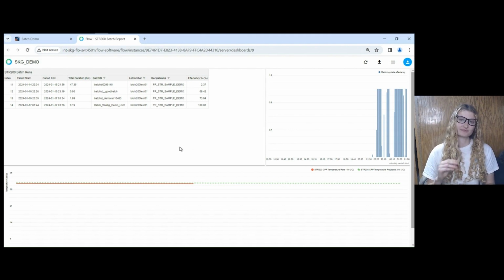And that's unfortunate, because the automation team would get contacted with, oh, night shift said last Tuesday a batch held because of something. And then we were the ones who would have to spend hours poring over electronic batch reports just to try to identify what happened and when. We're not even talking about fixing the problem yet.